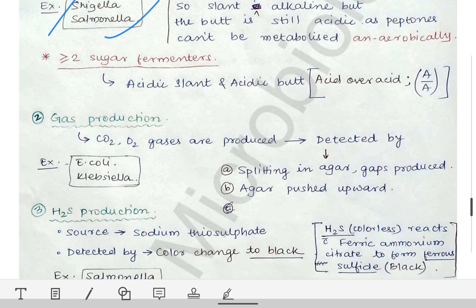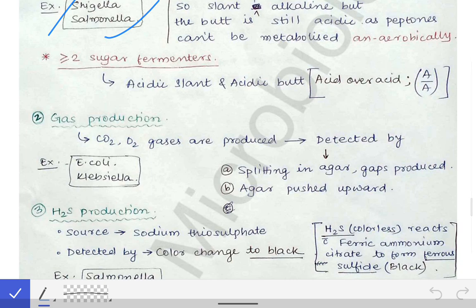If the bacteria is metabolizing both the glucose as well as the lactose and or sucrose, then it will be metabolizing those sugars in the slant as well as in the butt anaerobically. When they metabolize the sugars anaerobically, they will be producing pyruvate and different types of acids.